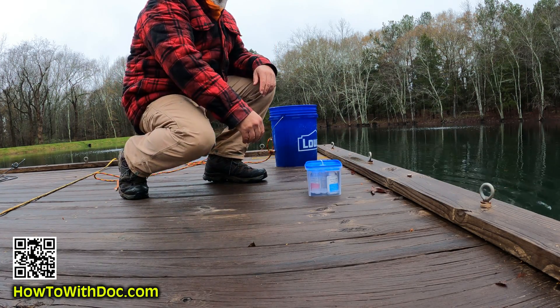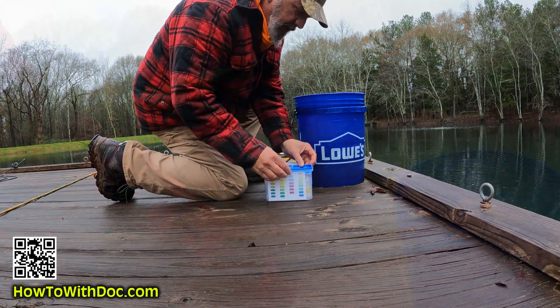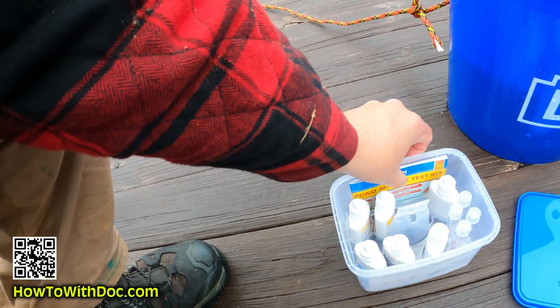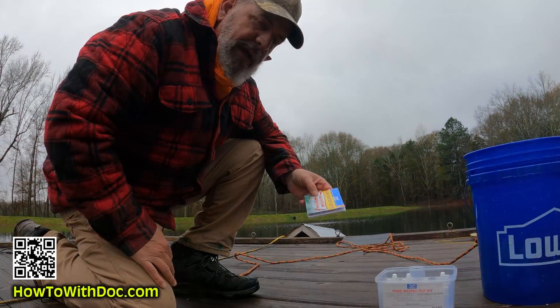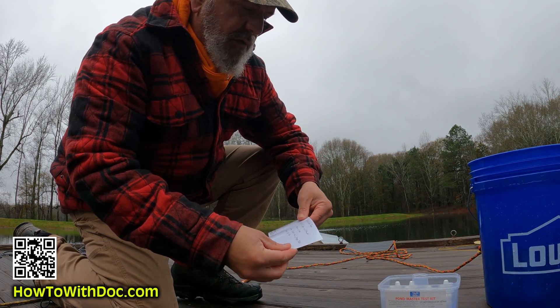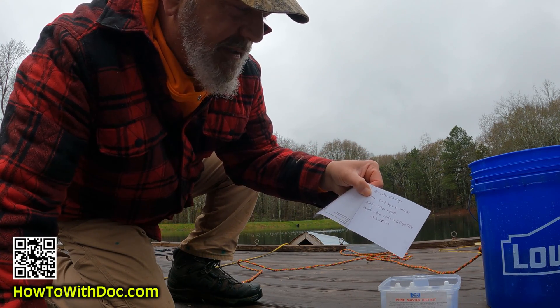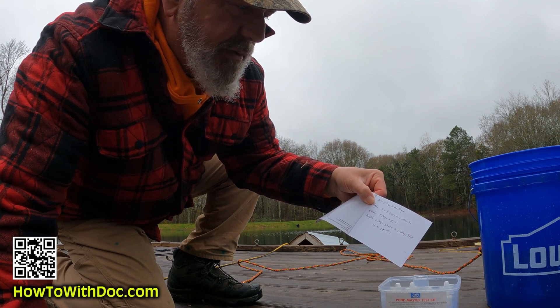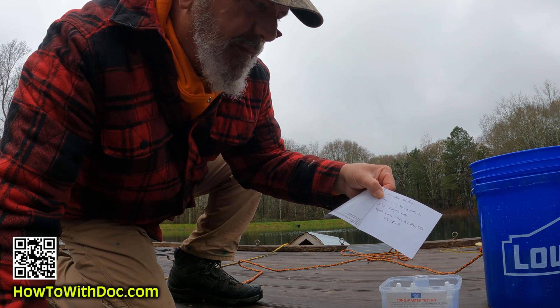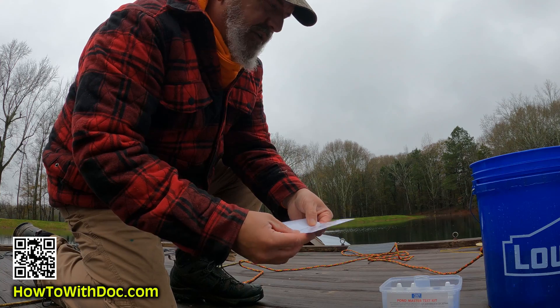Now I've got my sample. Inside the kit you're going to have four vials and then your solutions. One tip: I always forget how many drops go in for each test, so I made a cheat sheet on the back. For pH it's five drops; ammonia is eight drops, wait five minutes; nitrate is five drops, wait five minutes; phosphate is six drops, shake, then six drops of the thicker solution, shake again, and wait three minutes.